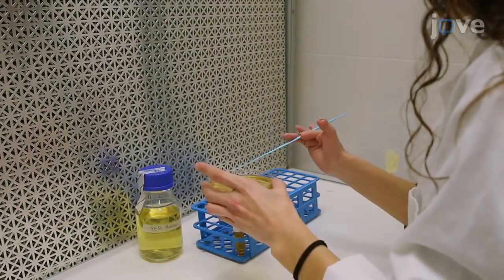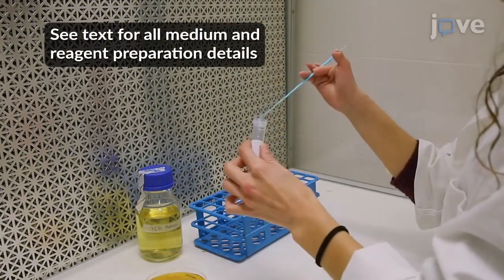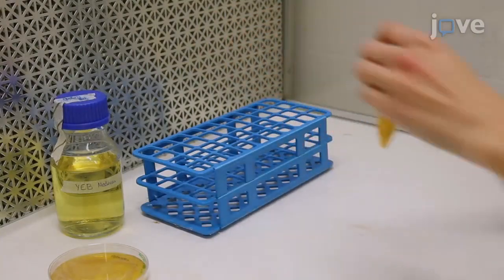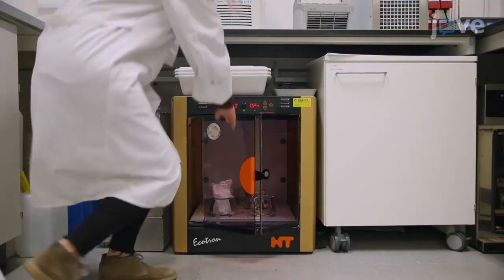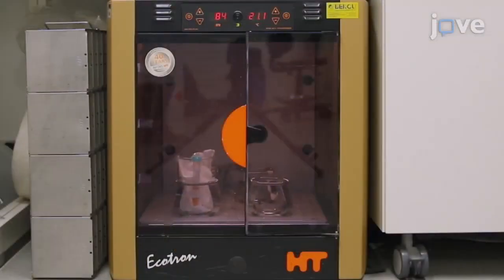Begin by growing a single Agrobacterium colony overnight in 5 milliliters of yeast extract broth or YEB medium supplemented with antibiotics in a 50 milliliter centrifuge tube at 28 degrees Celsius and 200 rotations per minute.